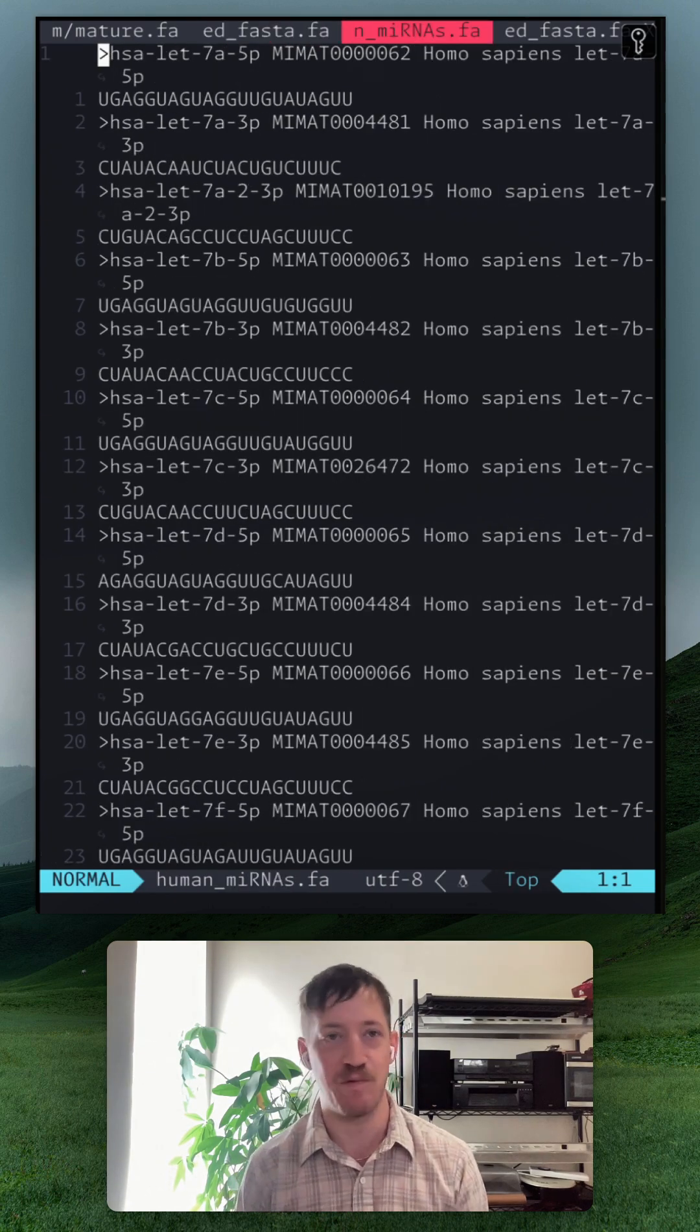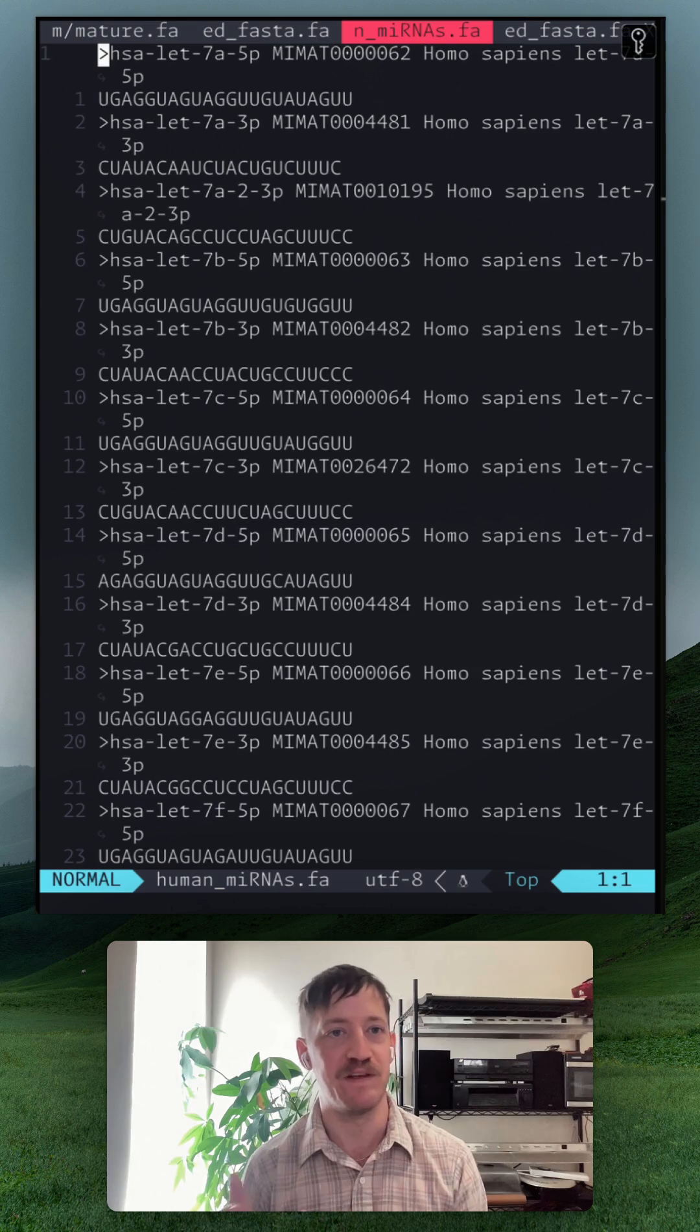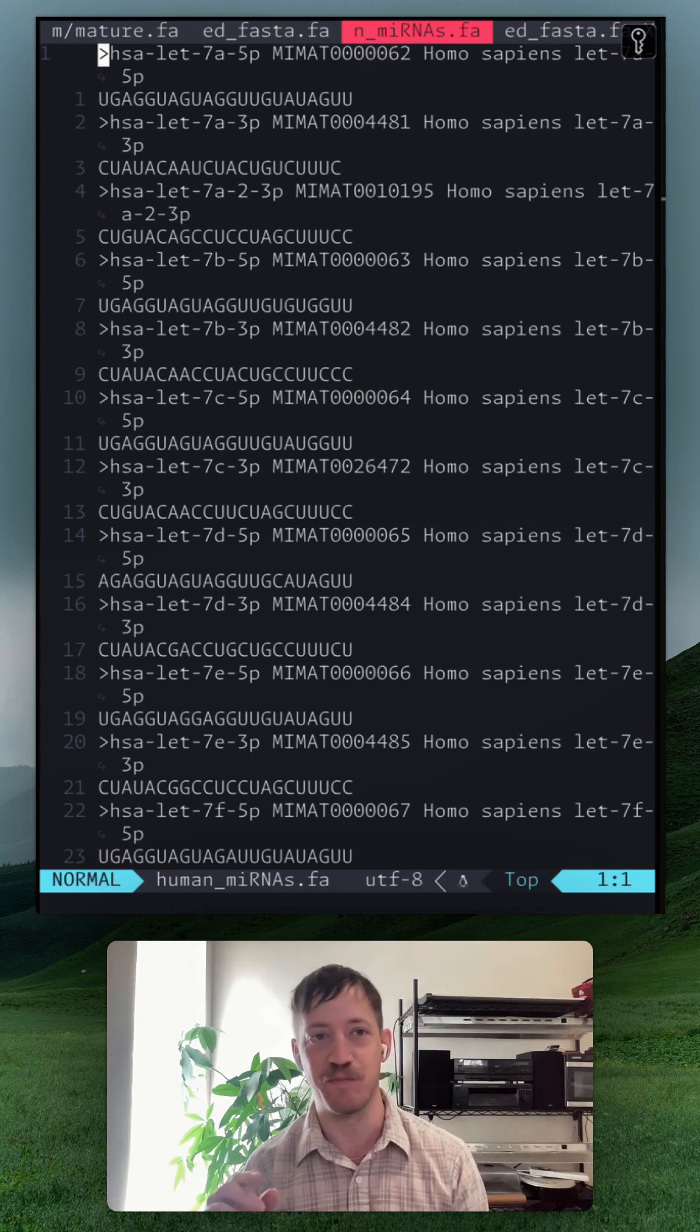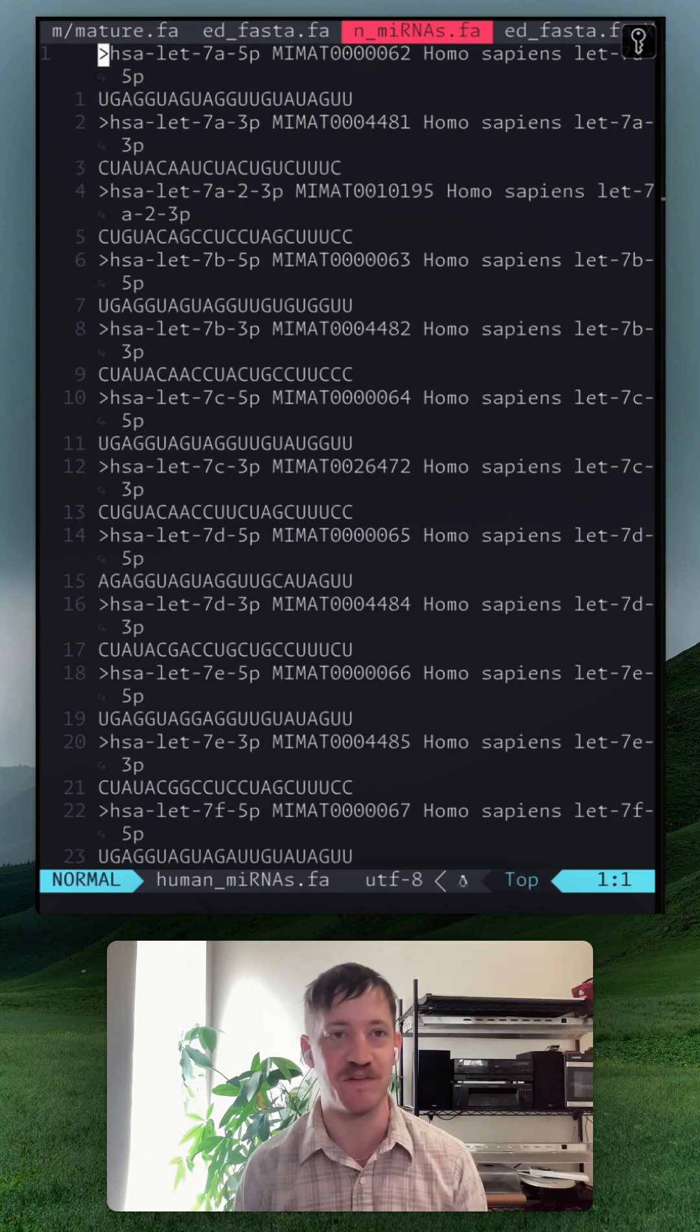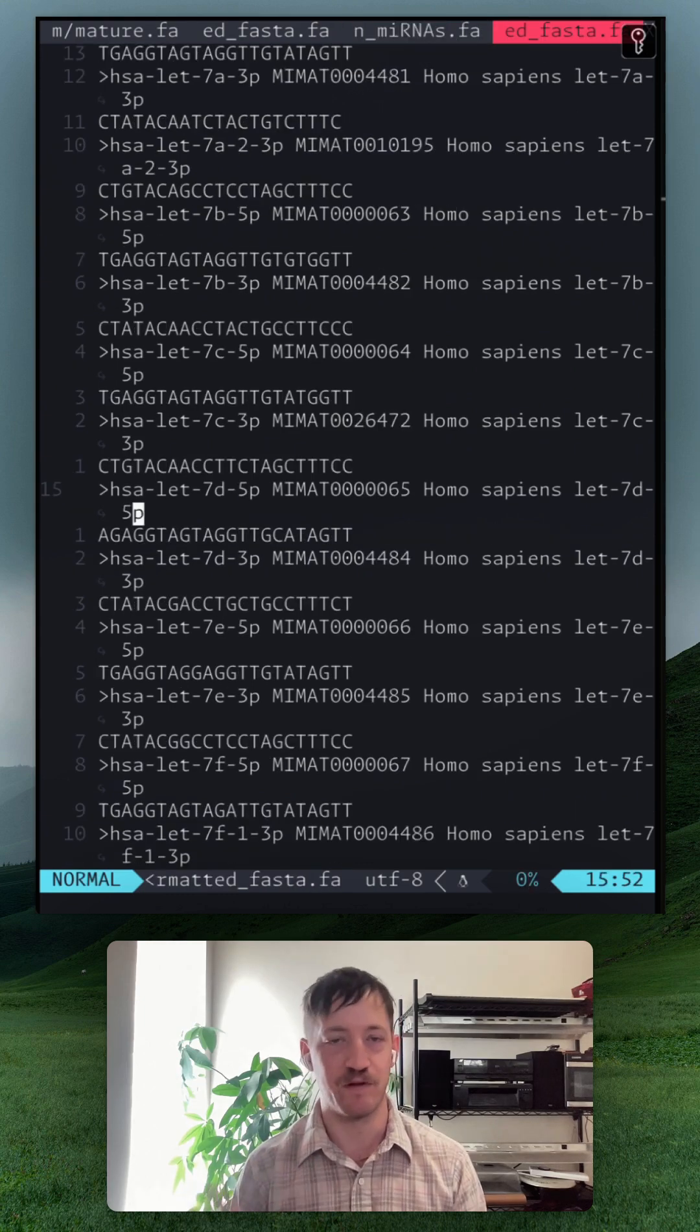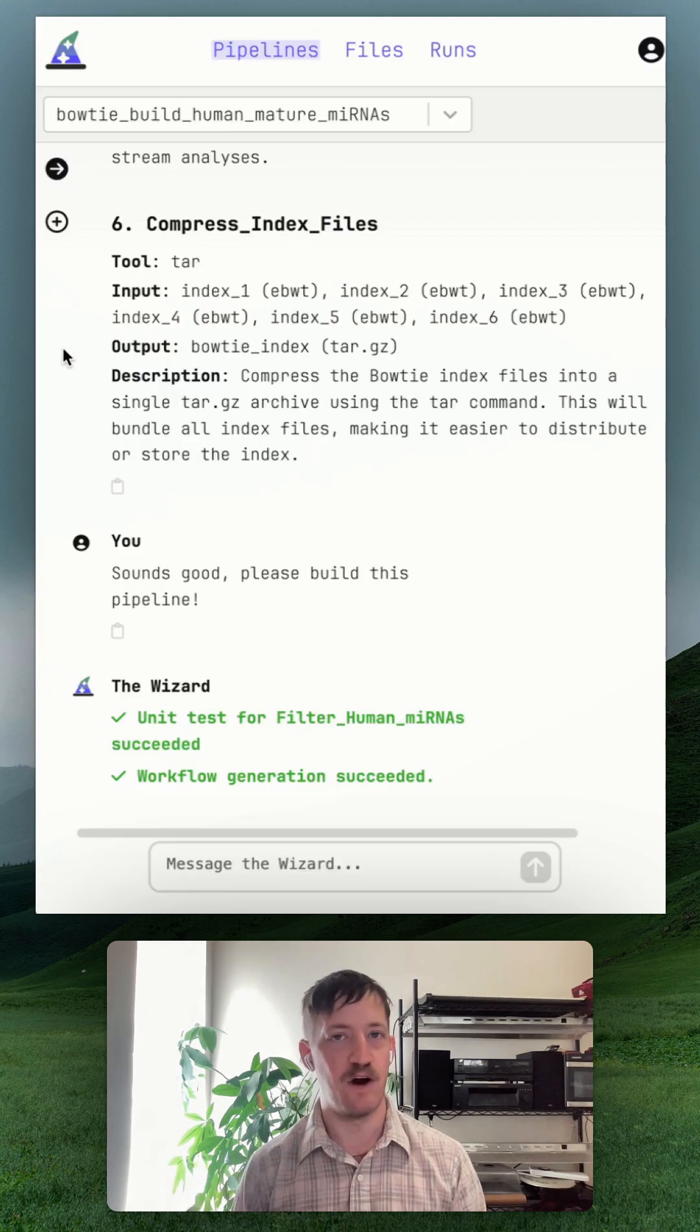And then because LibraryPrep replaces U's in the RNA with T's in DNA, we've got to replace our U's in the sequence with T's. And we've got to do all that before we build a reference.